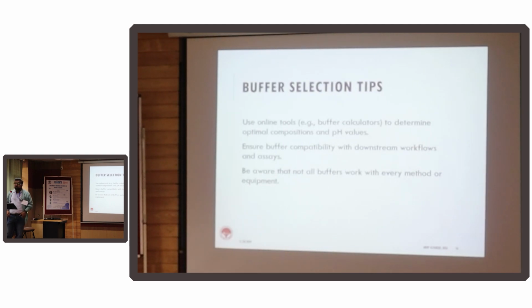And always remember that all buffers do not work with every method or equipment. So the downstream should be kept in mind.